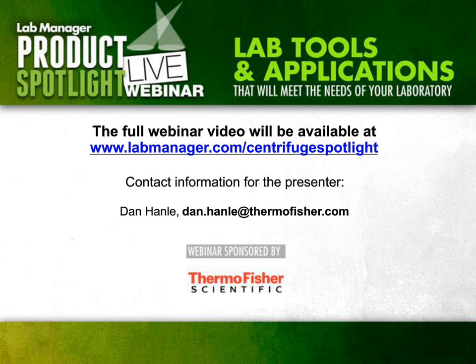And of course, also, if you see those rubber pieces are beginning to look frayed or in any way worn, it's certainly a case where a little bit of money now will save you a lot later if you have your service person come in, take a look at that, and maybe replace that protective boot. So those are some things.